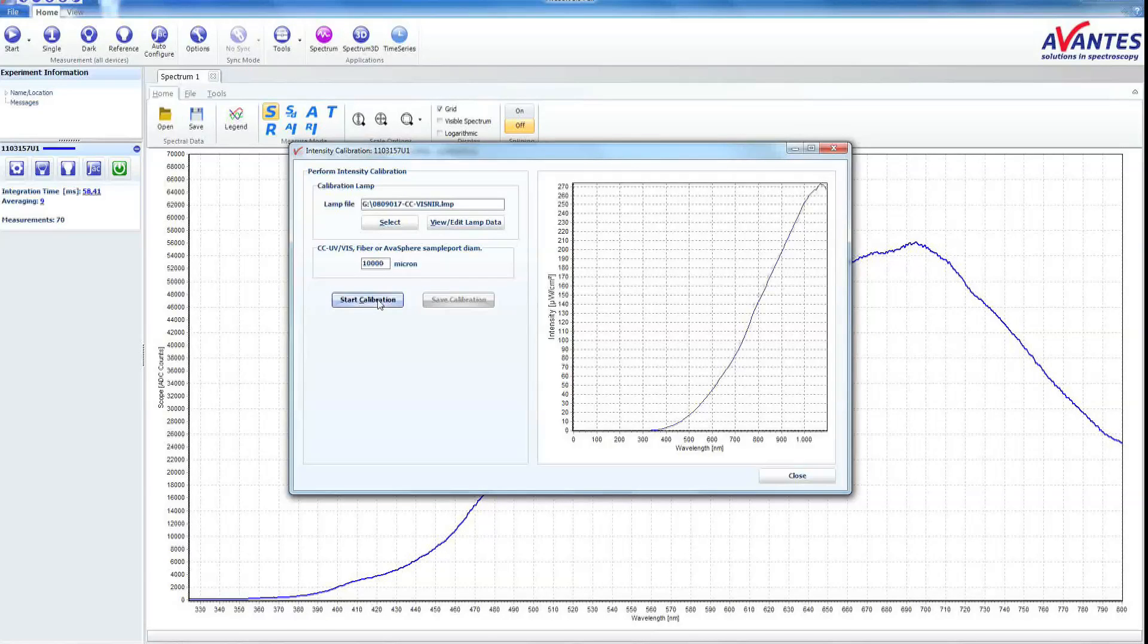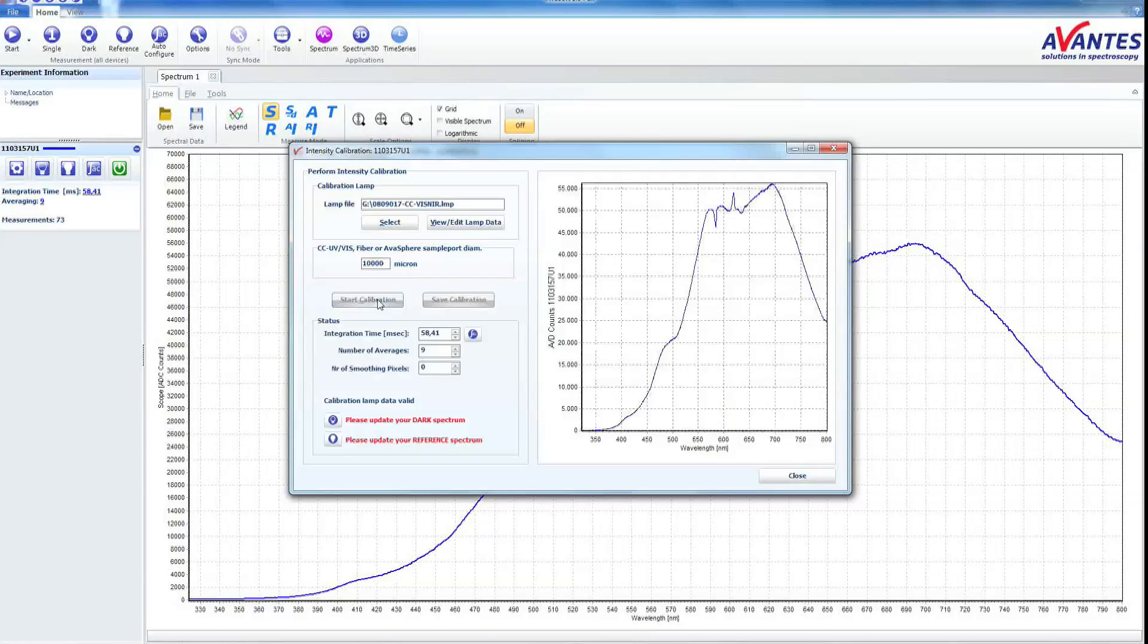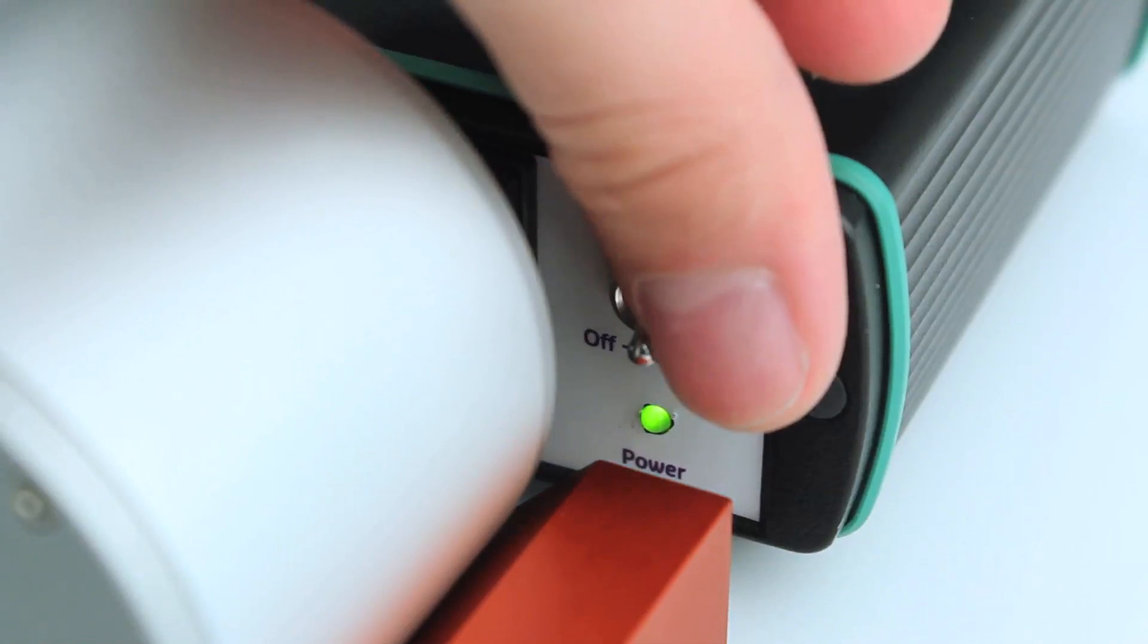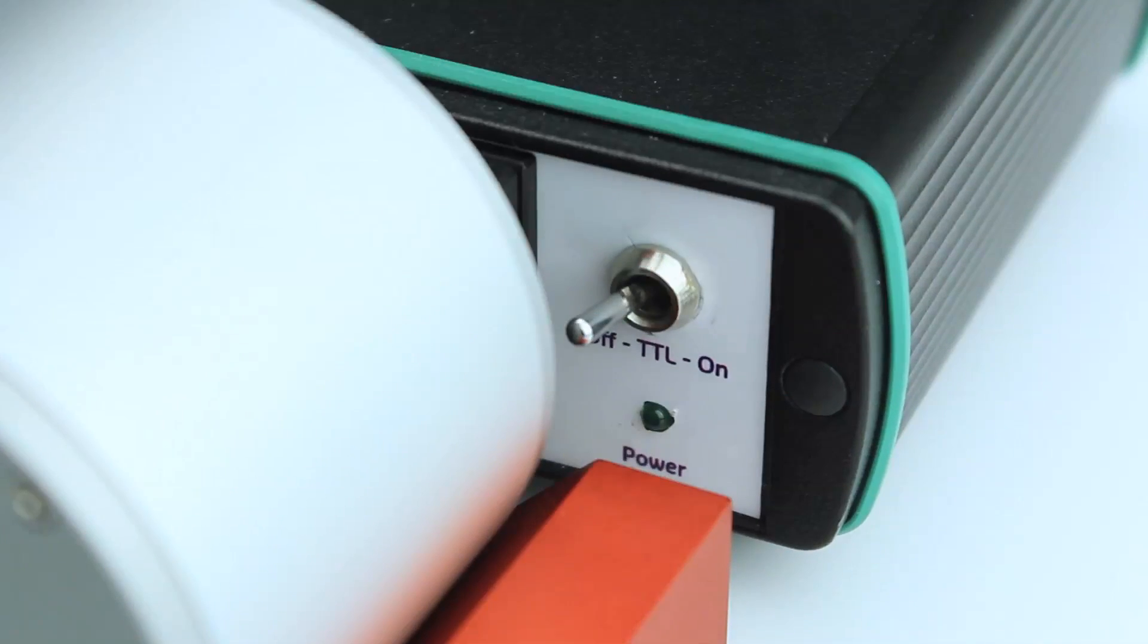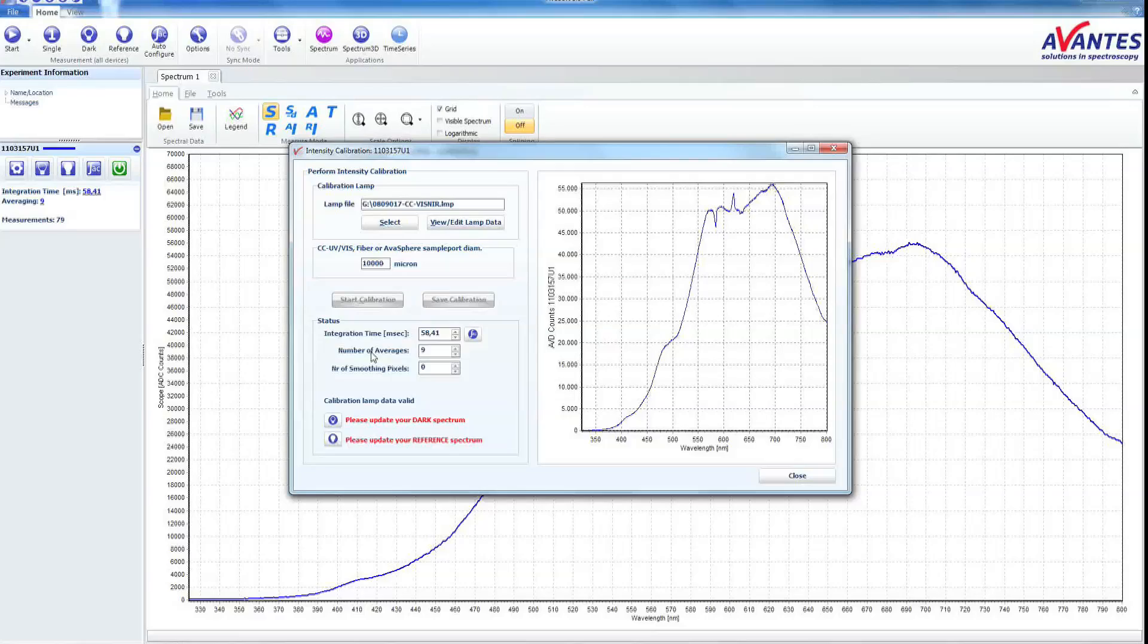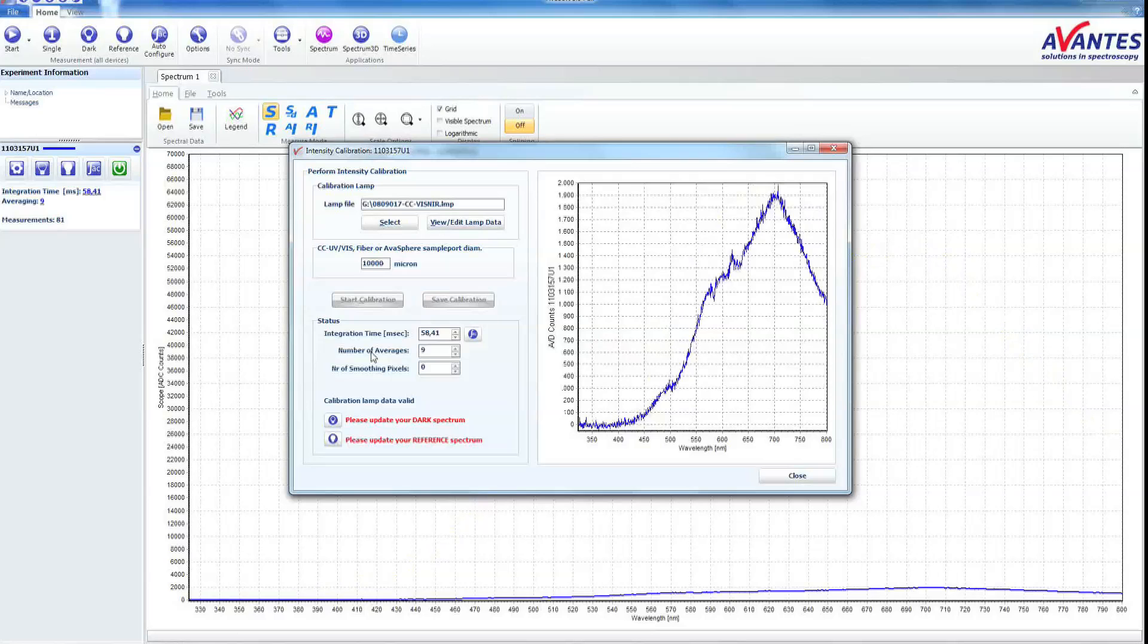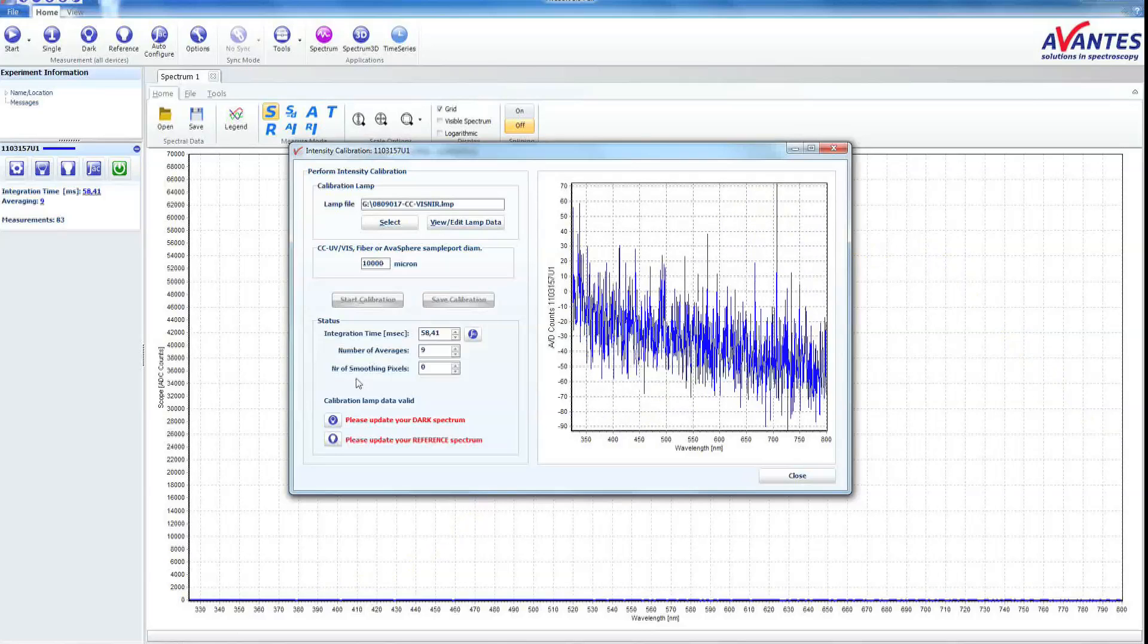Avasoft will tell you to take a white and dark spectrum. Please switch off the light source. Now take a dark reference.